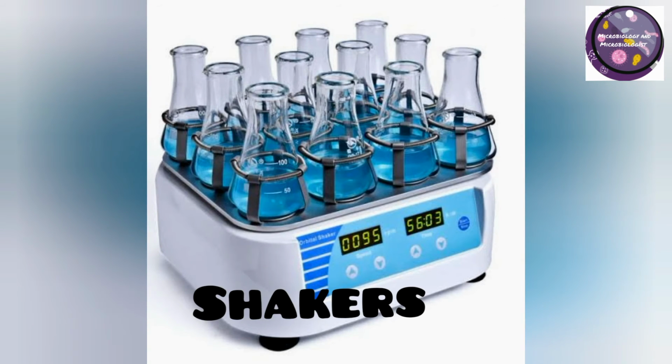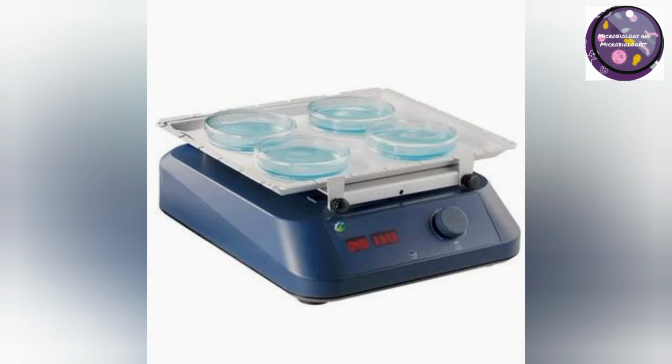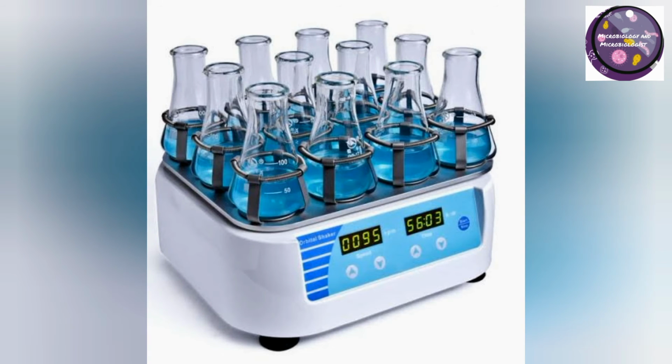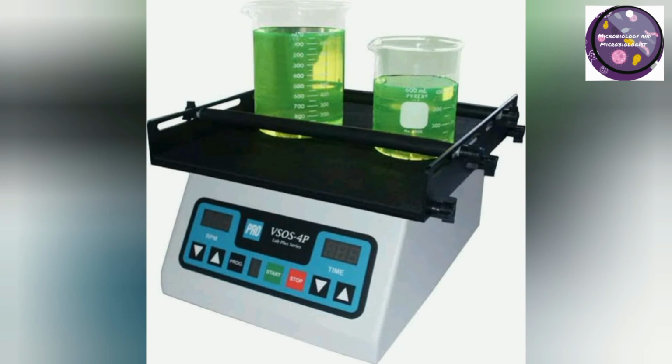Shakers or orbital shakers. A shaker is a piece of laboratory equipment used to mix, blend, or agitate substances in a tube or flask by shaking them. It is mainly used in the fields of chemistry and biology. A shaker contains an oscillating board that is used to place the flasks, beakers, or test tubes.